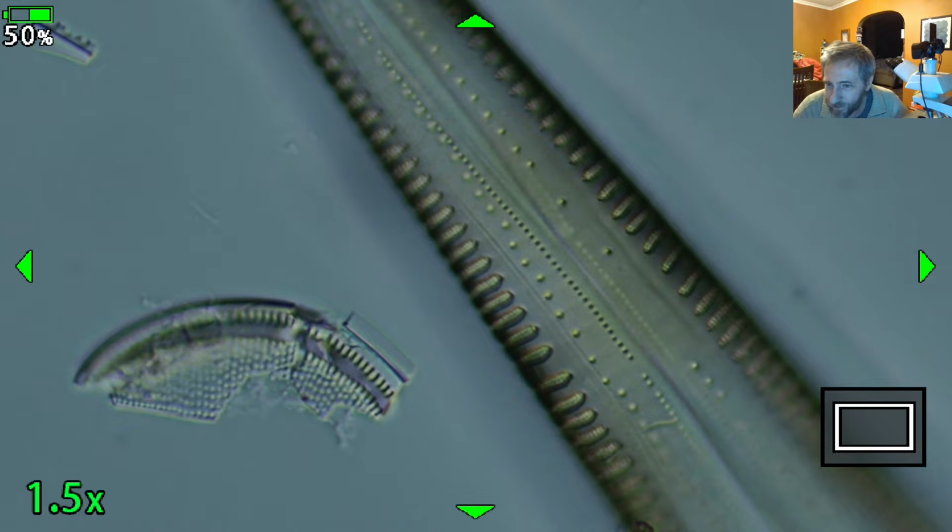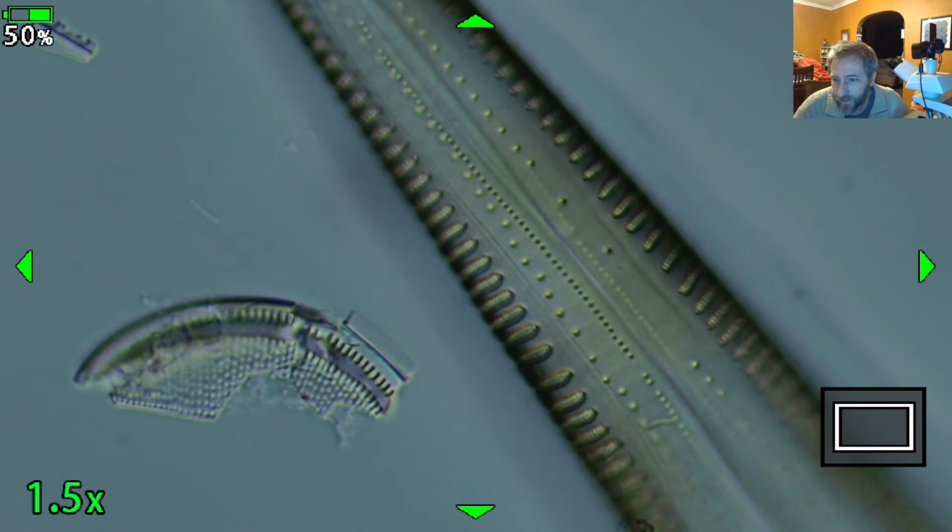How micro are diatoms? Diatoms are usually in the size range from about 2 microns up to maybe a millimeter for the really biggest ones, but in terrestrial systems most are about 2 microns to about 100 microns. So they're in what a geologist would refer to as the silt size fraction. Some of them might be a little bit smaller, into the clay fraction, and some might get up into the sand fraction, fine sand, just for clarity.